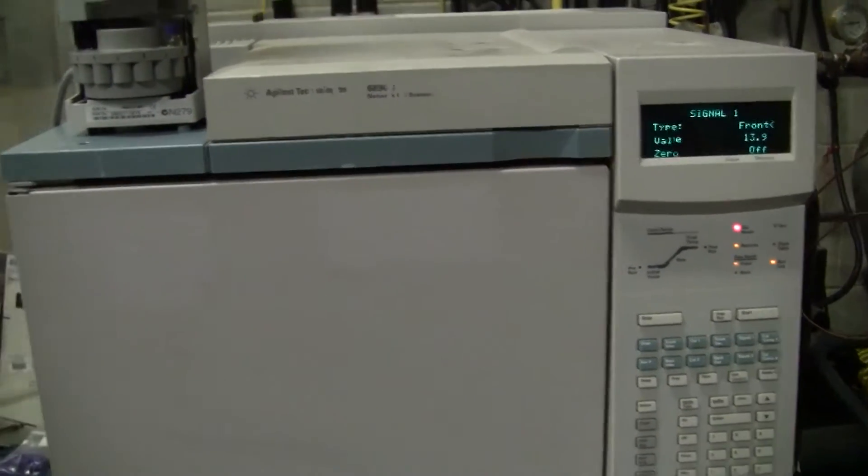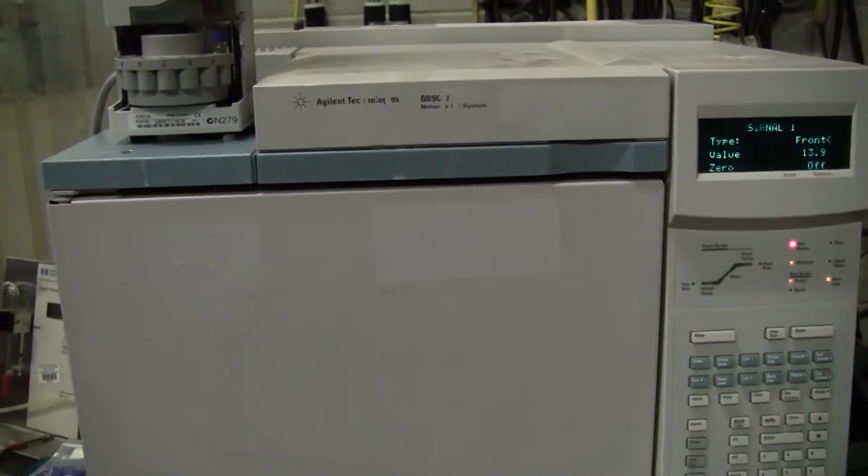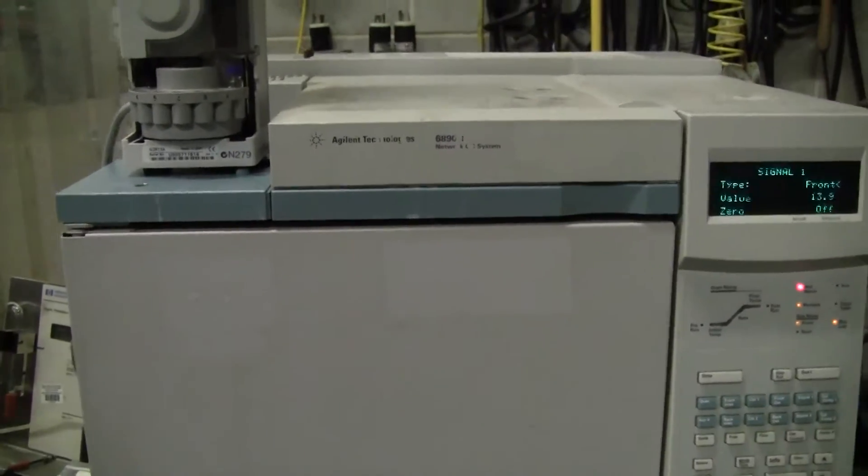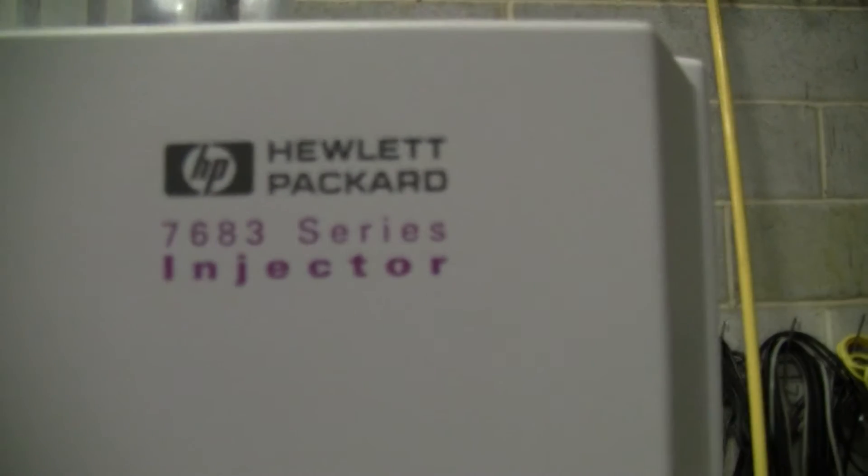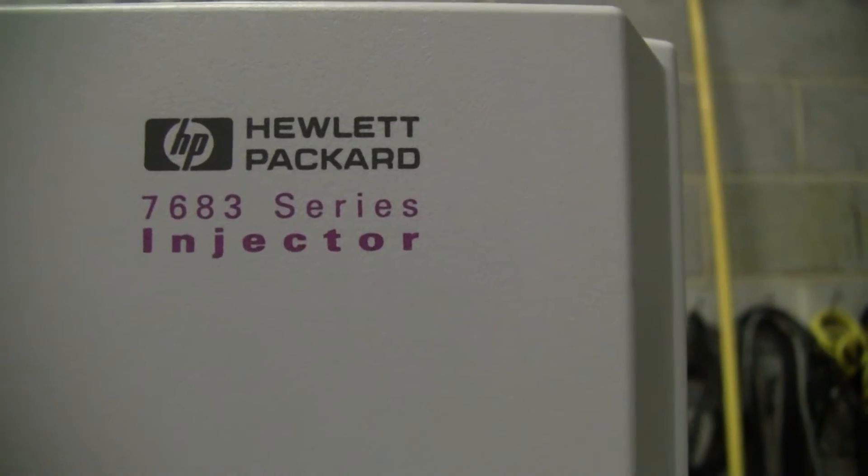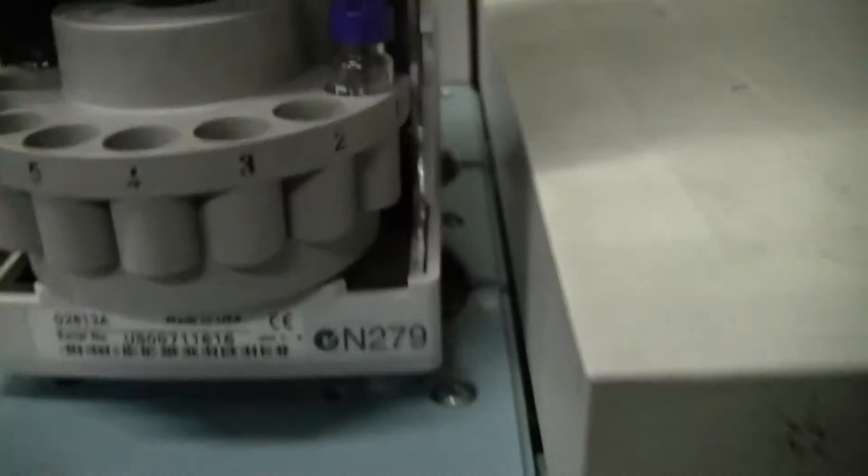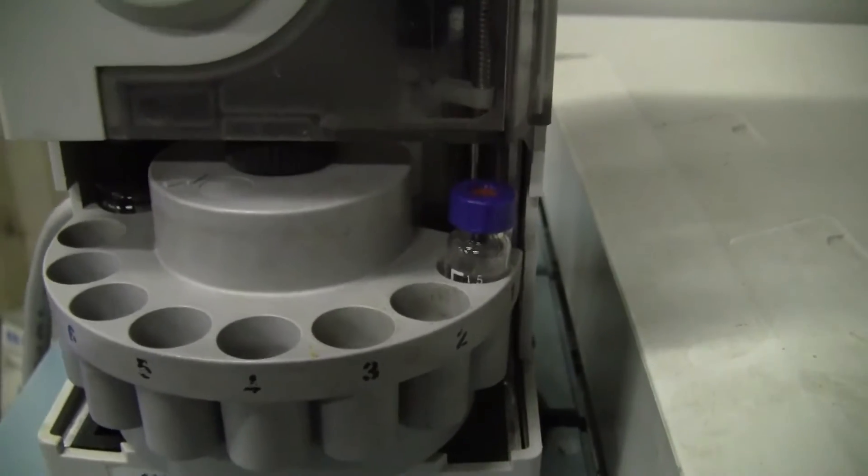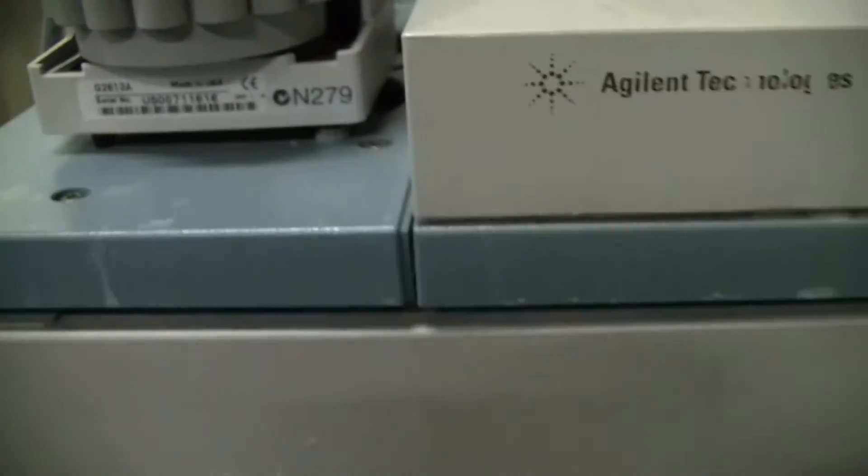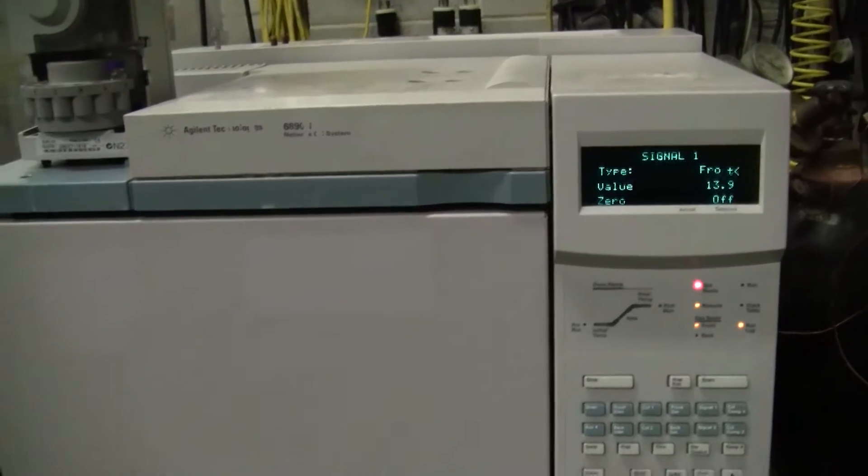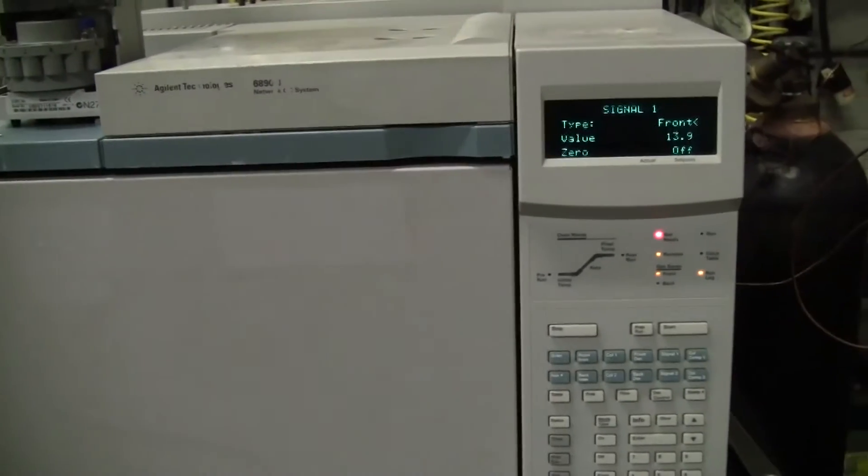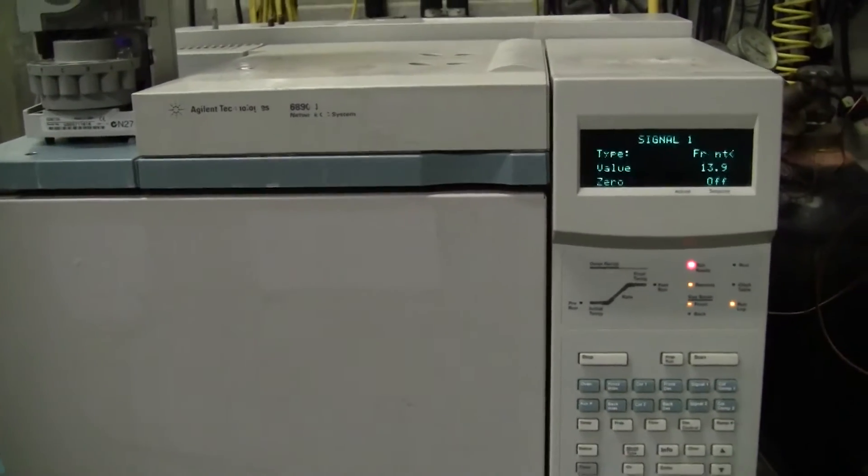This is a FID detector, split splitless. It has on it a 7683 series injector, sample vials. We're running a network, its communication method is by network interface.